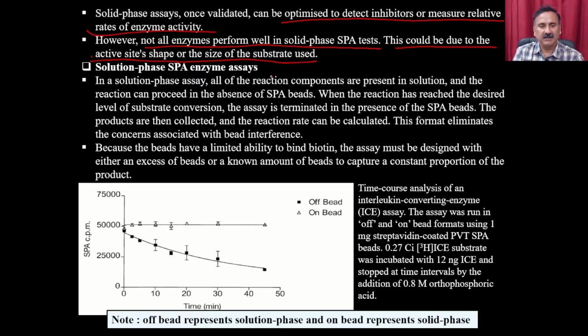Solution phase SPA assays. In a solution phase assay, all of the reaction components are present in solution, right? And the reaction can proceed in the absence of SPA bead. When the reaction has reached the desired level of substrate conversion, the assay is terminated in the presence of SPA bead.